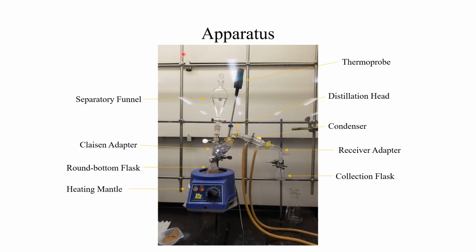With steam distillation, though, it's not useful for purifying anything. It's just useful for separating stuff, like separating chemicals from physical components or other liquid components, but not for purification. So we don't need a fractionating column here. We need the Claisen adapter because we need to continuously add water to our flask just to make sure that this experiment doesn't ever run dry.